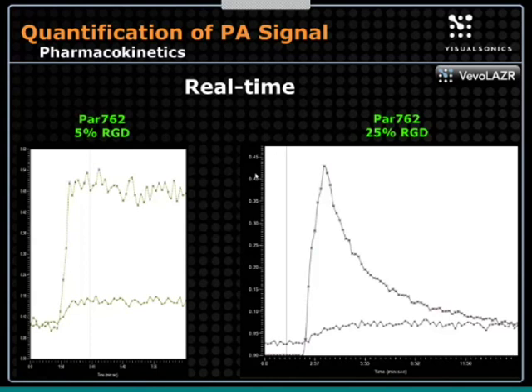Now, if you want to compare the absolute values, you make sure your ROIs are the same size and that kind of thing. And there's other ways to do it as well, which I won't get into the details here, but there's ways of applying a threshold to the signal you're detecting to try and not detect noise and that kind of thing. I should add that we're open to suggestions on how to apply some of these measurements in our software.